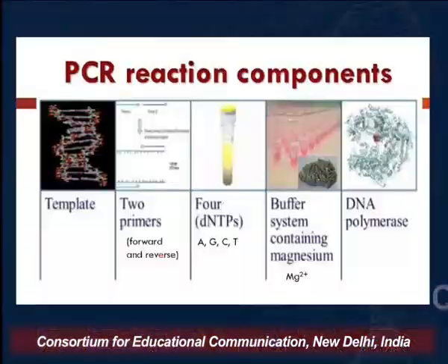Now let's look at the PCR reaction components. This PCR reaction is like any in vitro reaction that we do in biotechnology. So obviously you need certain components, you mix them together, you incubate at the right temperatures, or whatever the principle behind it, you use those steps and you amplify that product.